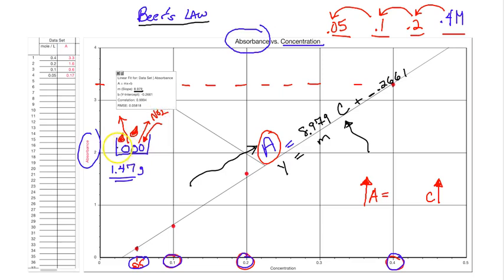After a period of time, all of our solid Cu0 became copper plus 2, along with the zinc plus 2. The zinc plus 2, for reasons we've explained, is colorless, so we're able to measure the molarity of the copper plus 2, because in crystal field splitting, it absorbs some wavelengths of light, which means it appears to have a color.